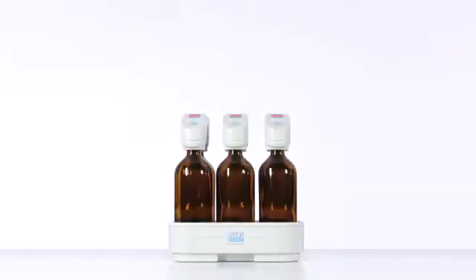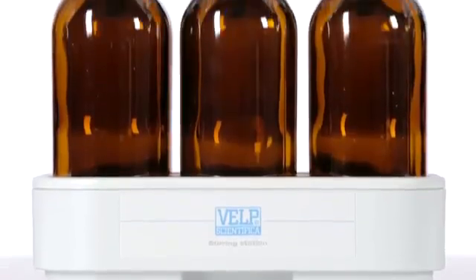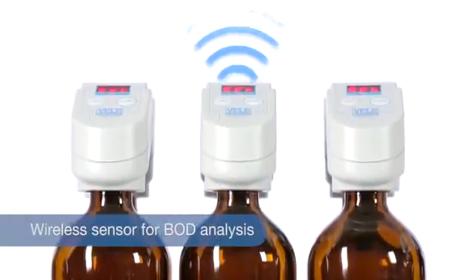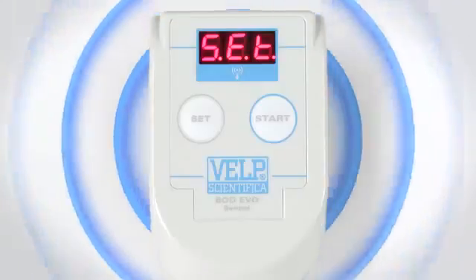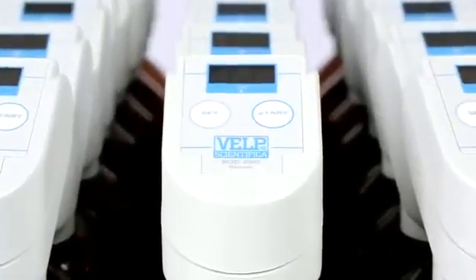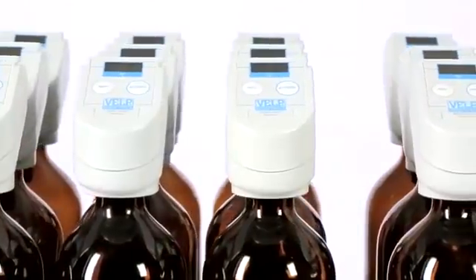The BOD EVO sensor from VELP Scientifica is the unique and revolutionary wireless sensor for biochemical oxygen demand. BOD is a test used worldwide in which standardized laboratory procedures are used to determine the organic substance degradation by microorganisms in wastewaters, effluents and polluted waters.